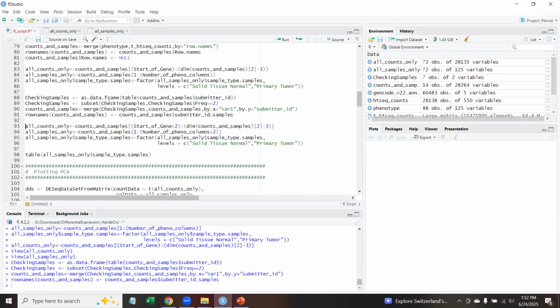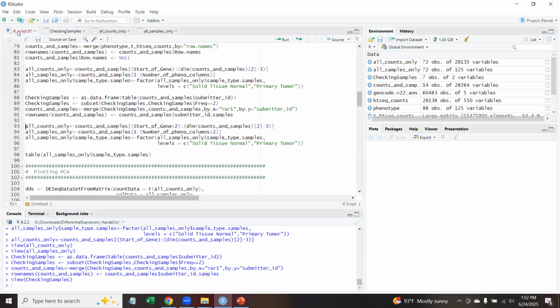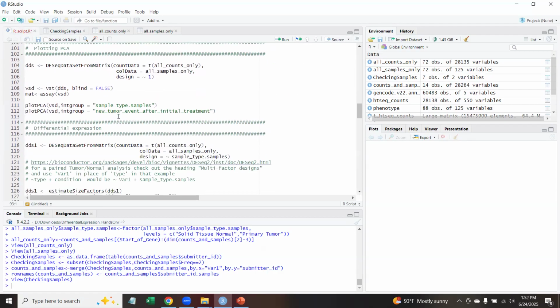it's identifying samples in our data set that have tumor and normals present in the data. And there are only 7 of these. See? Yeah, these 7 samples from our filtered sample data table are the ones with both tumor and normal. If you wanted to do a paired tumor normal analysis, this is what you would boil it down to. And there's a stronger, more elegant statistical test you could do. It's a paired statistical test. I talk about it in the comments down here.